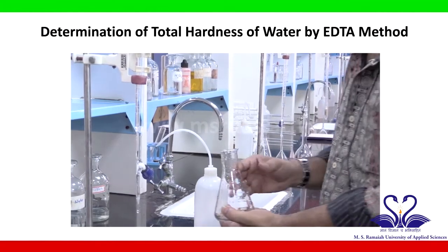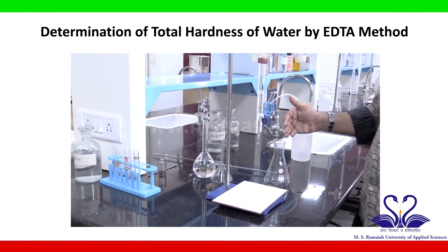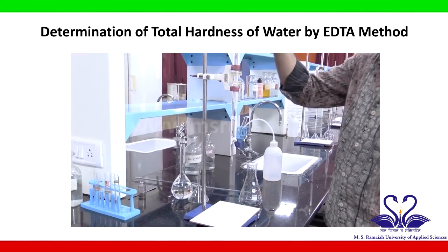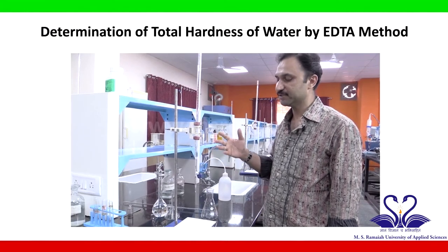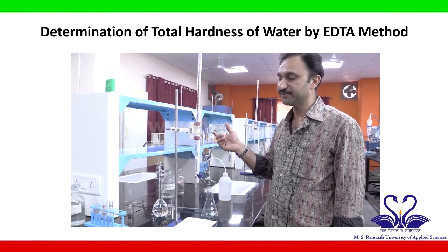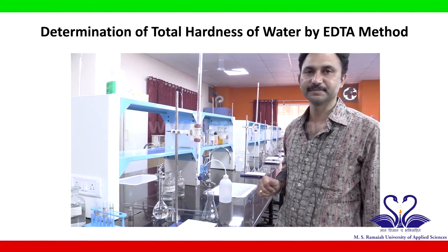Now you can continue the second titration by taking the hard water sample, adding indicator, you will get the wine red, and you can continue the titration. You have to do the second trial, and the third trial also. Do 3 trials and take concurrent readings. They should be the same readings, and you can use them for the calculation. This completes the experiment.